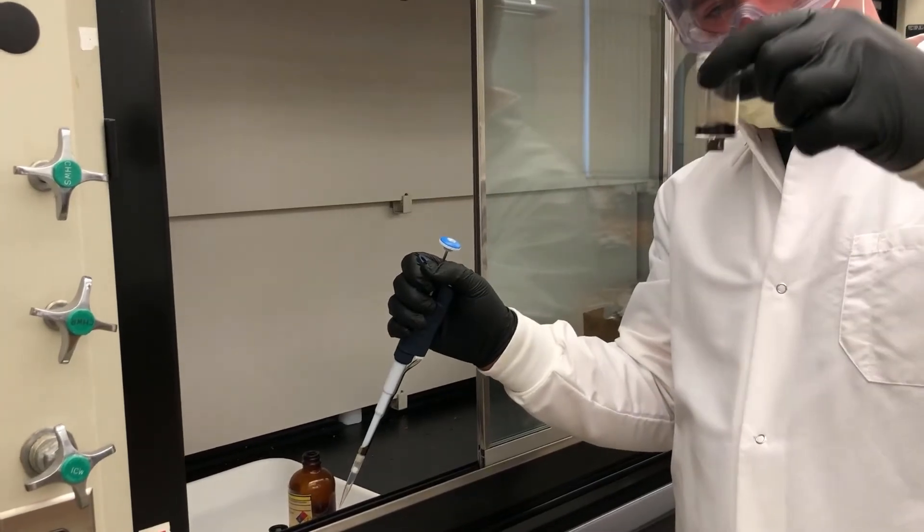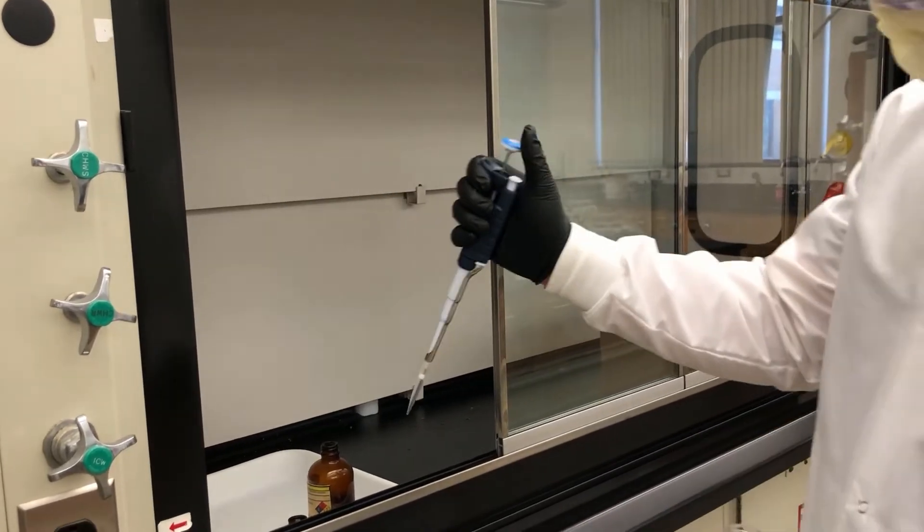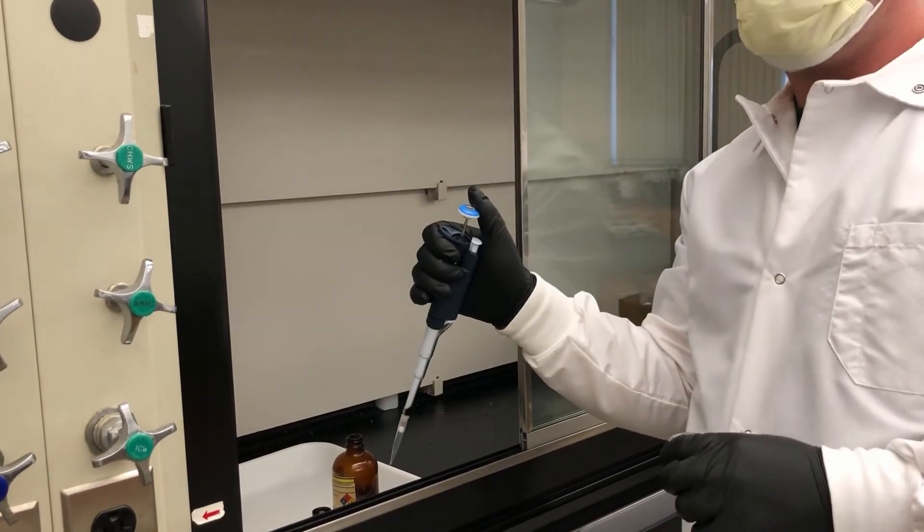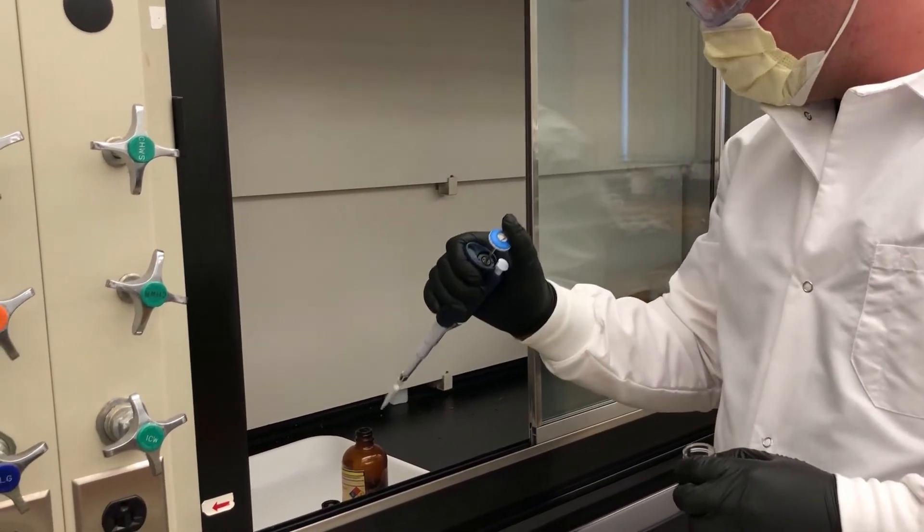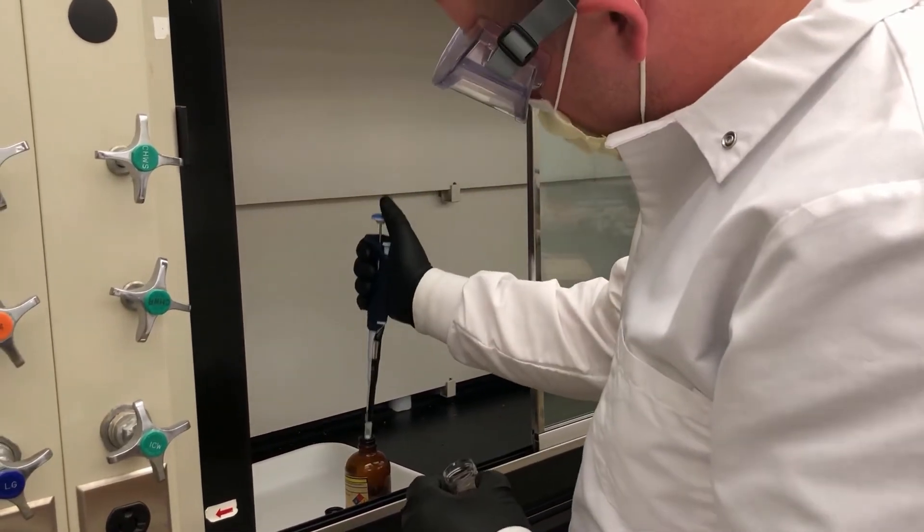Okay. So now we have our nanoparticles and our ferrofluid is almost complete. What we need to do now is I have my micropipette and we're going to get about one milliliter of tetramethyl ammonium hydroxide out of here and add it to our ferrofluid. So let's do that.